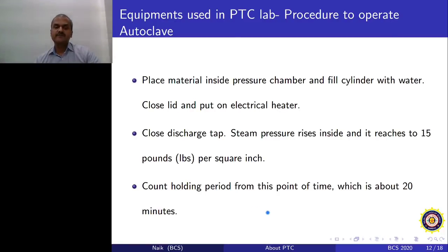Sometimes it is found that people hurriedly finish this autoclaving period. Students want to go early, or anyone working with the autoclave wants to finish the work early, so instead of counting 20 minutes, he counts just 10 minutes or 5 minutes and then switches it off. In that case there is a likely chance that you will have some bacterial or fungal contamination in your media in spite of sterilization. So one has to confirm even after 20 minutes whether your sterilization is sufficient to eradicate the contamination.